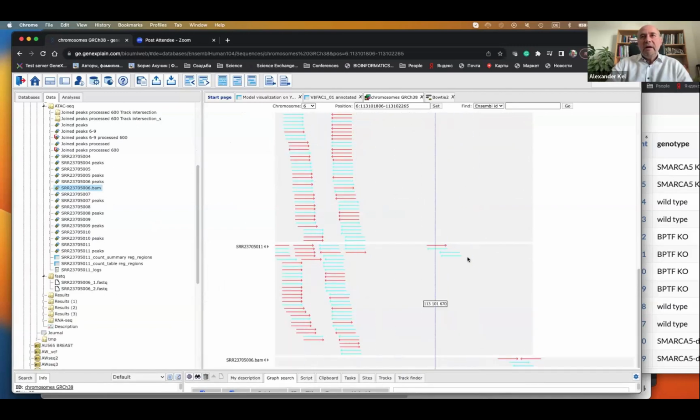In fact, in that area which we are looking at now, and I will talk about this area a bit later, there are very few peaks, very few reads. These demonstrate the reads in that area. This is in the other example, after knockout of the transcription factor, and the wild type actually contained quite huge peaks in that area.